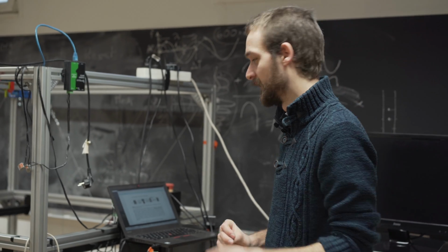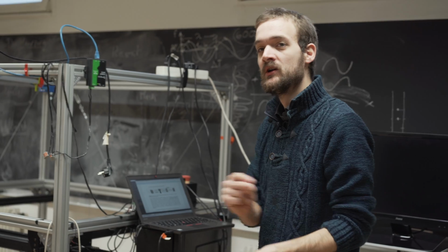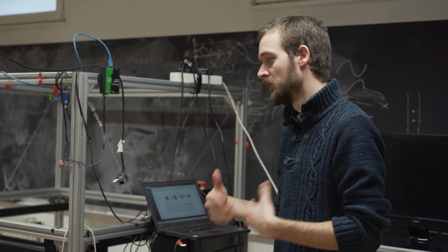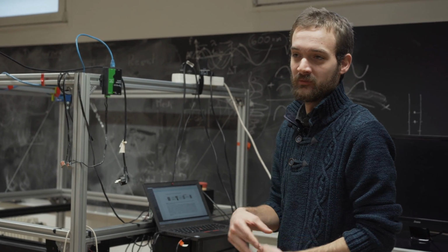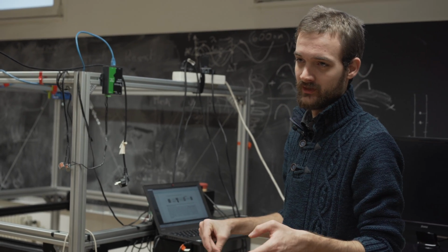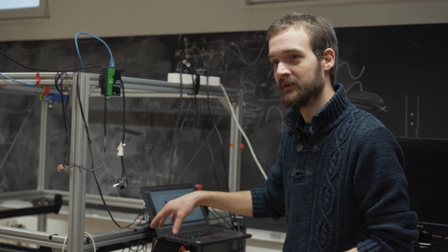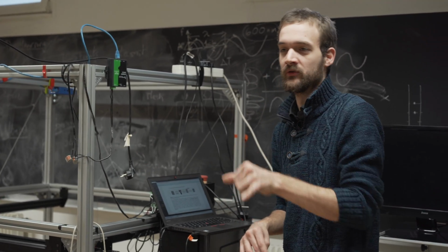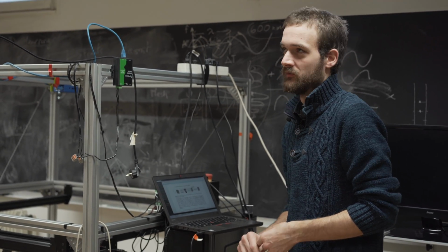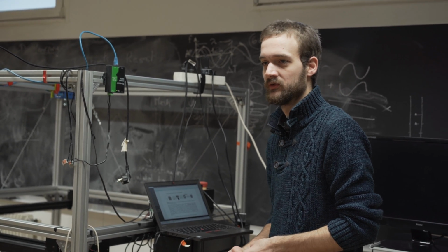Some of them, like from the 3D volume, the segmentation and the measurement of angles, that is completely developed by us. There is a common library for the hardware and the control of the scanner. Then some components use open source software like Colmap. It's a very well-known photogrammetry software, which is completely free and open source.